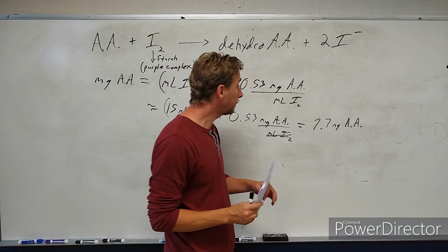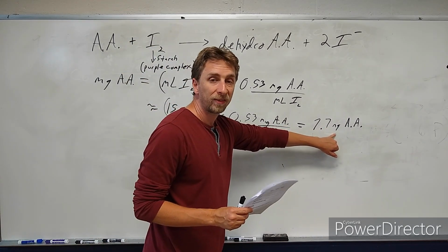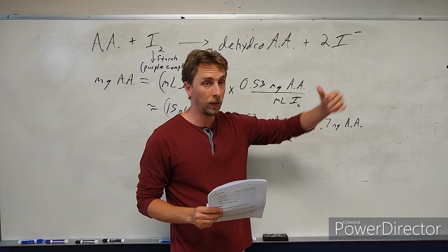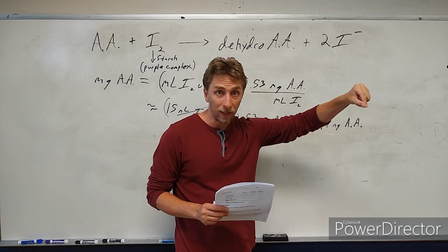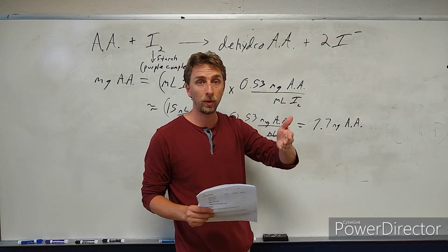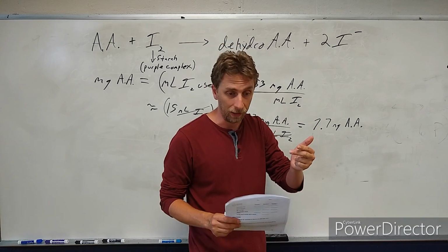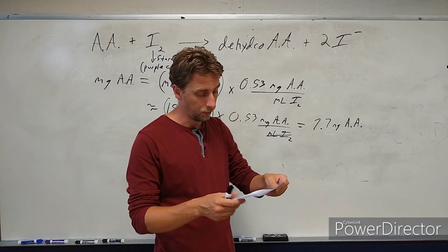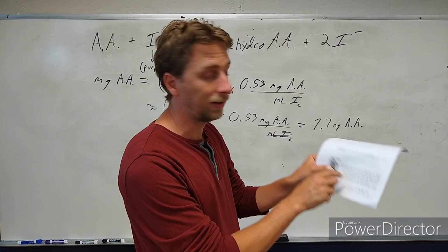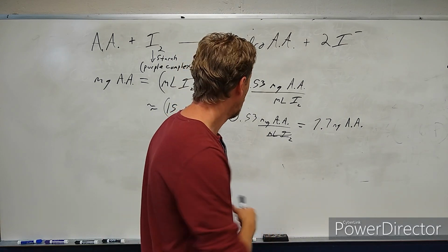Anyways, the point is, that many milligrams of ascorbic acid was in your juice sample. And in the setup, you saw I poured about 20 milliliters of juice into the beaker. And that's what we're going to start with in the flask in a minute, I think 20 milliliters of juice. It says right here in the procedure, it says 20 milliliters of juice for each flask.